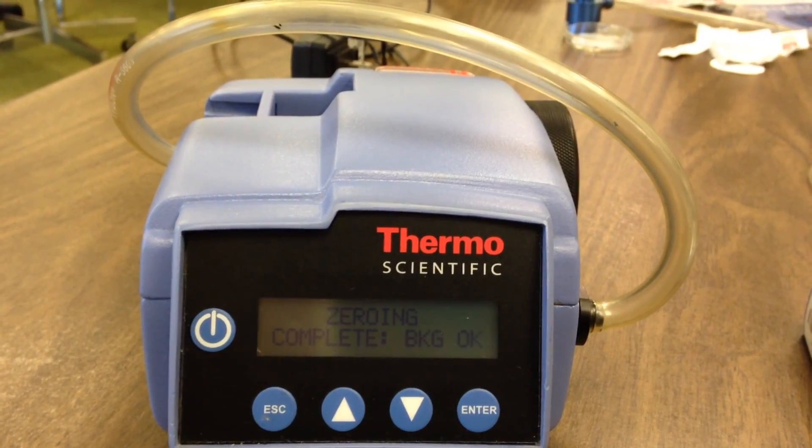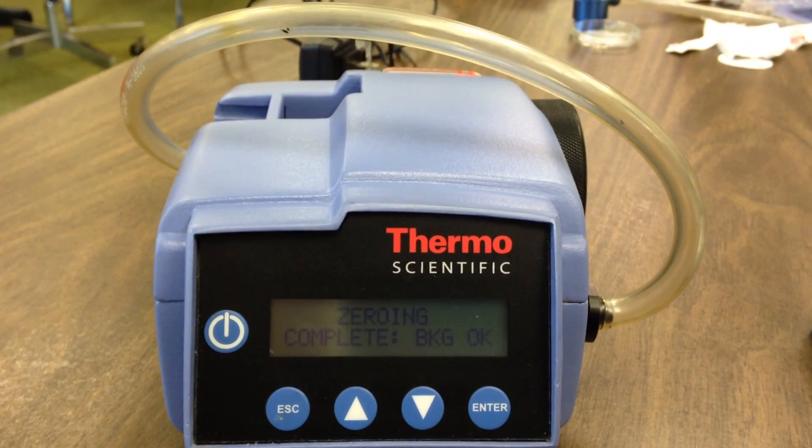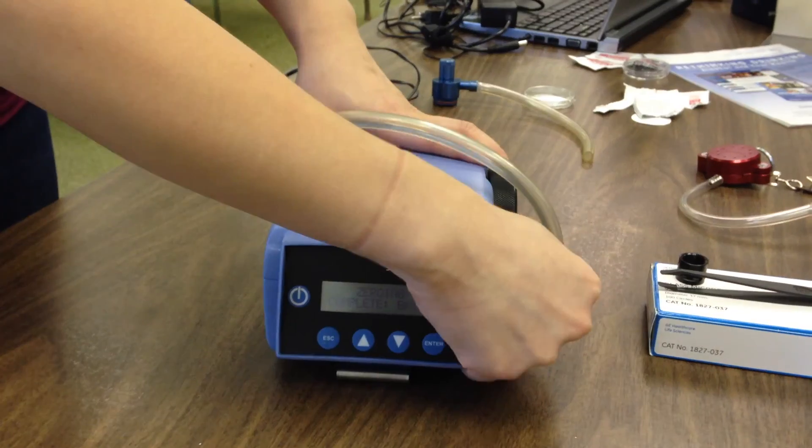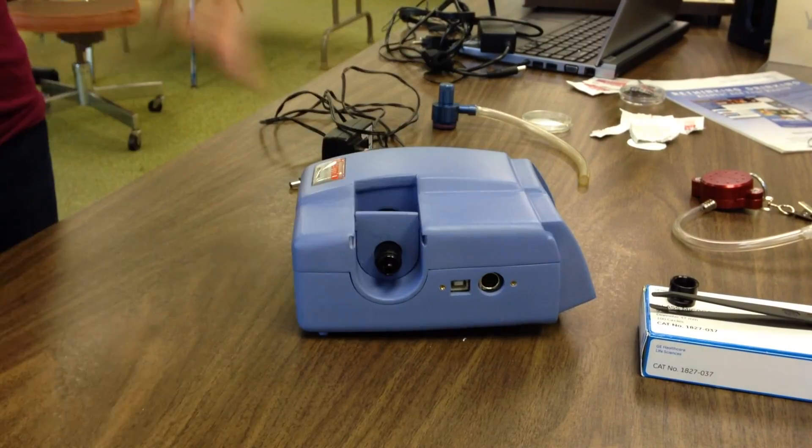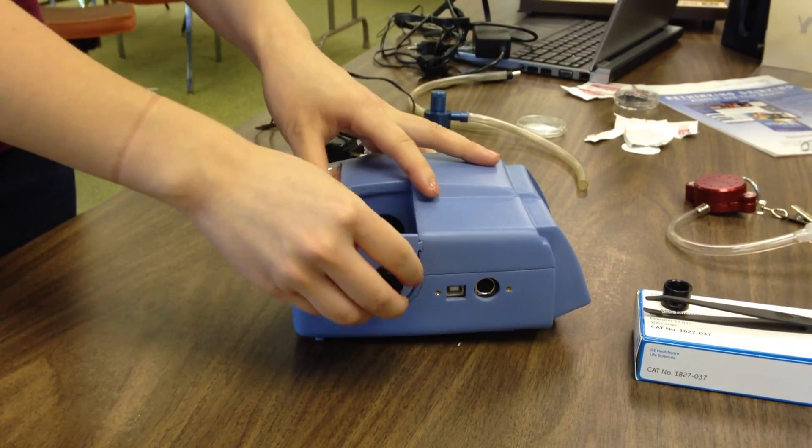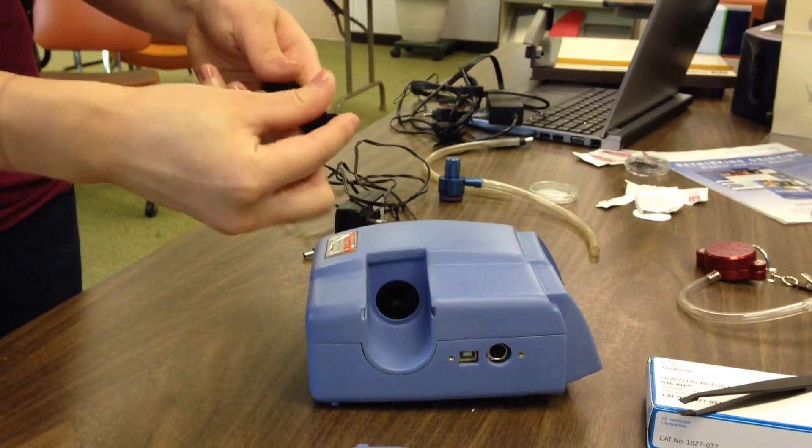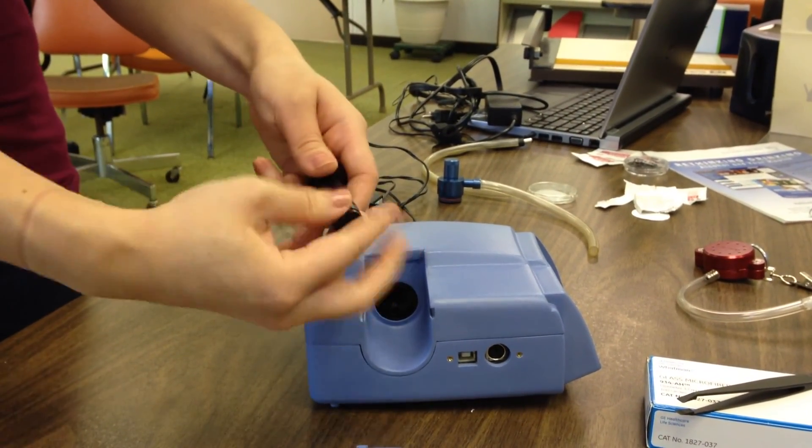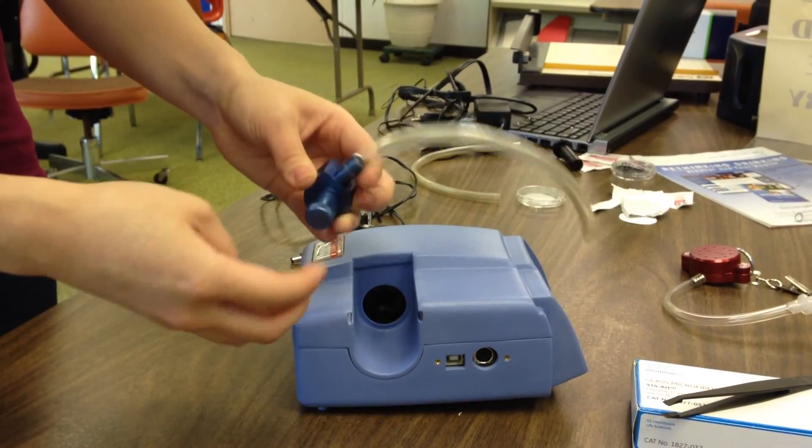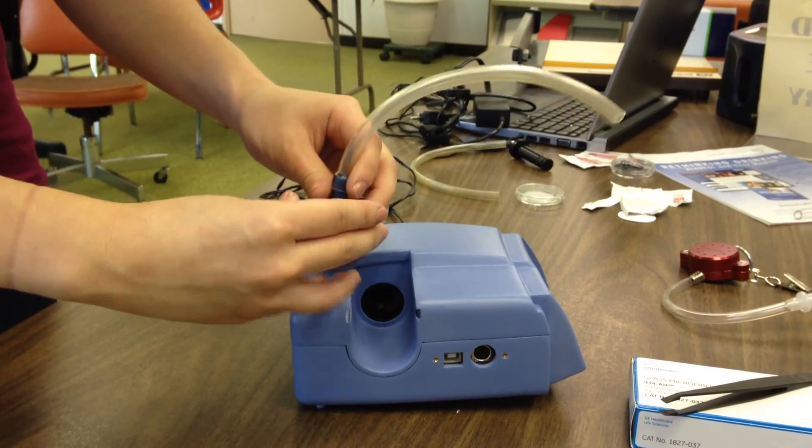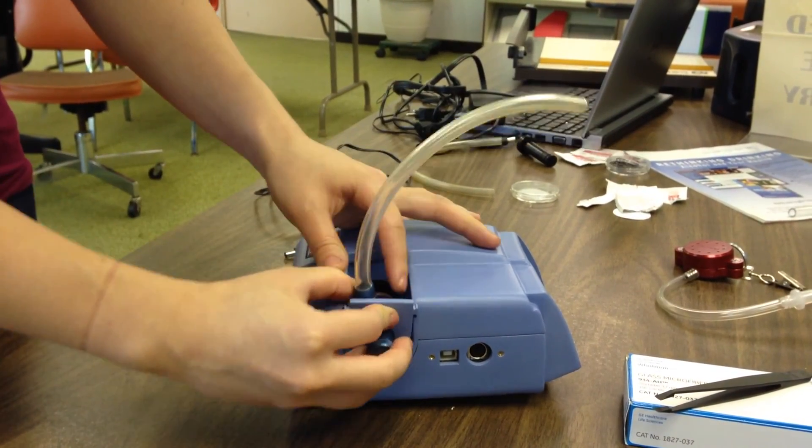If the measurement was successful, the screen will show that zeroing is complete. After zeroing is complete, remove your tubing, then take out the total inlet from the side of the PDR and replace it with the blue cyclone to begin sampling. Make sure that the tubing is secure and unobstructed.